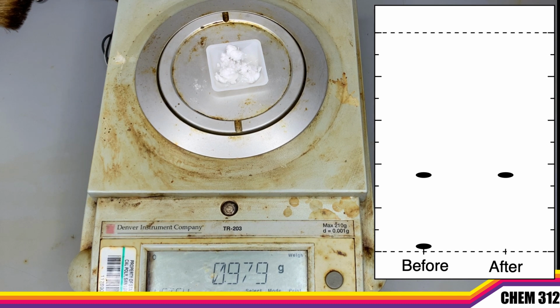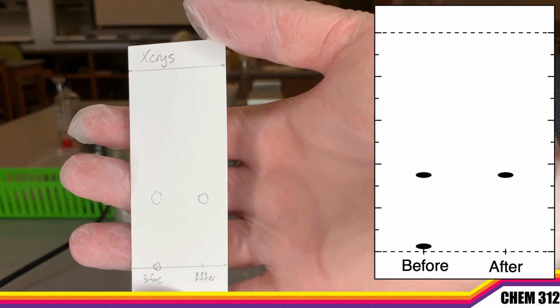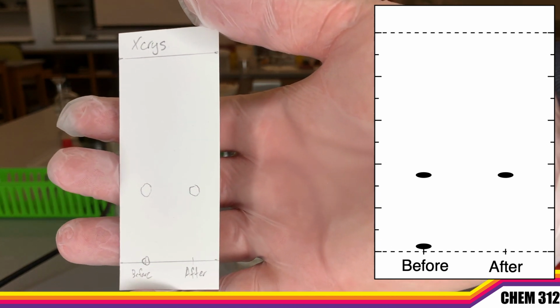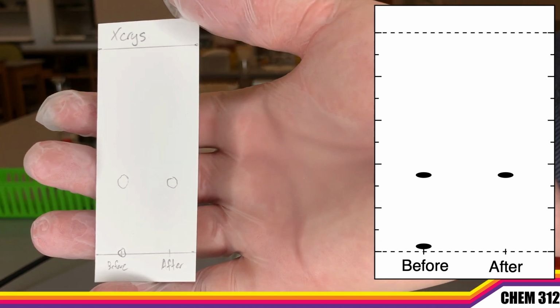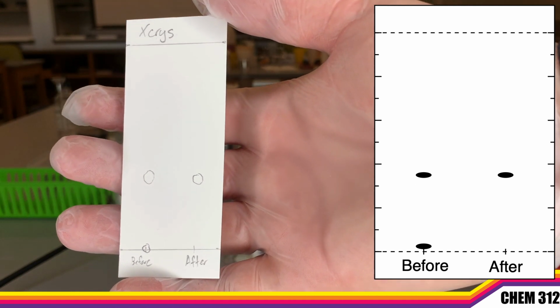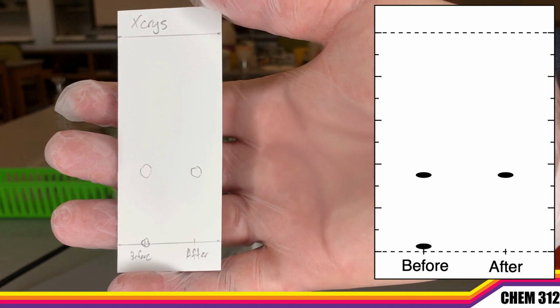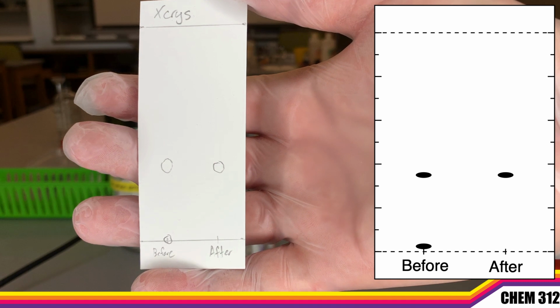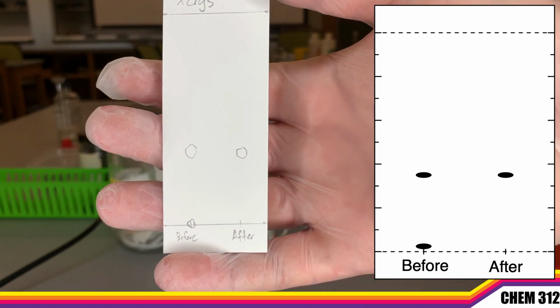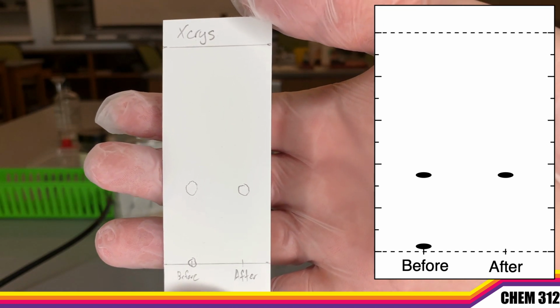So let's test it now and look at our TLC to see if this recrystallization actually worked. So here's our TLC plate for our recrystallization. And so we can see that before our recrystallization, we had two different spots that were contained in that sample, caffeine and salicylic acid. And after our recrystallization, we only have one. So our recrystallization enabled us to purify this mixture just by changing the solubility due to temperature. So again, beforehand, we had two compounds. Afterwards, we had one. That means we were able to purify our sample.